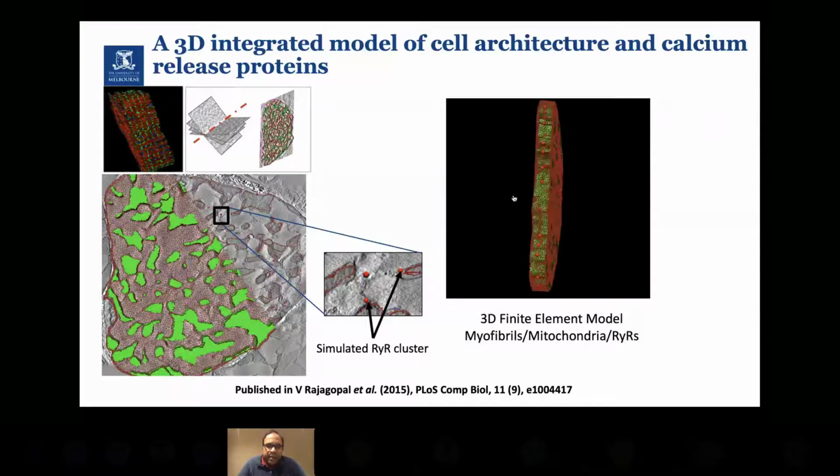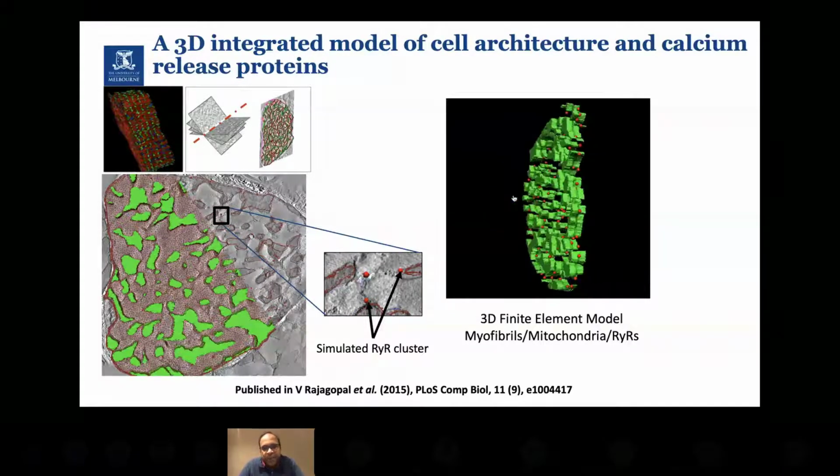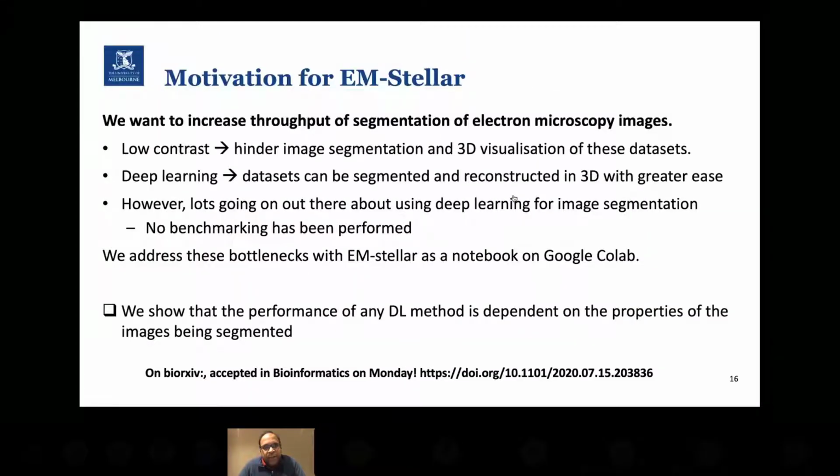So through the years of developing these models using electron microscopy data, one thing we've always hit as a bottleneck is segmentation of these images.